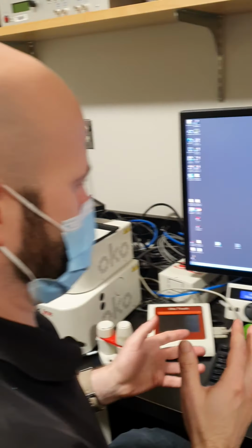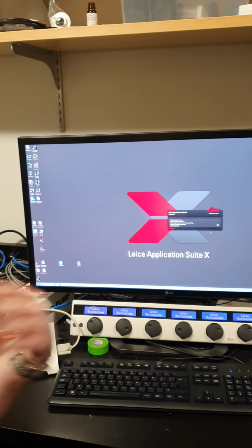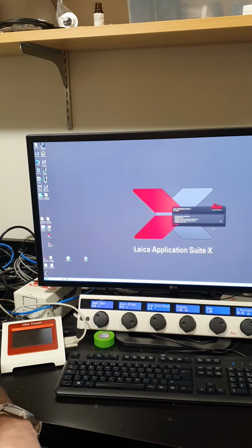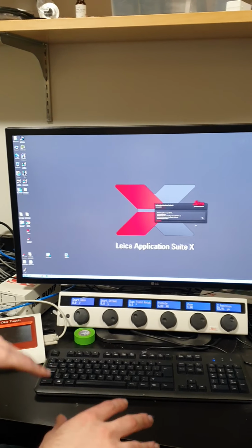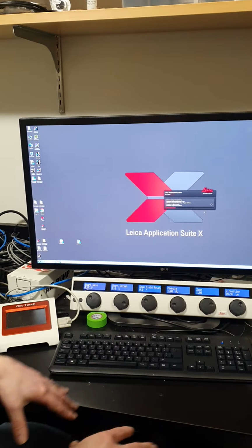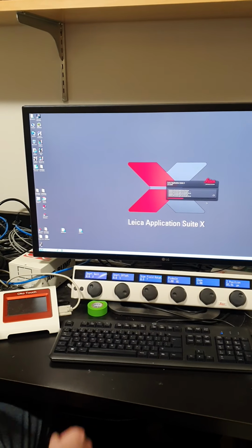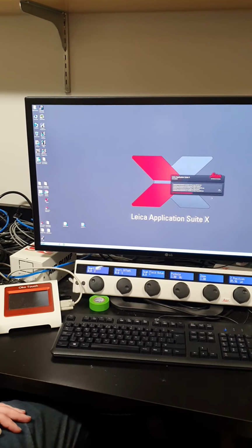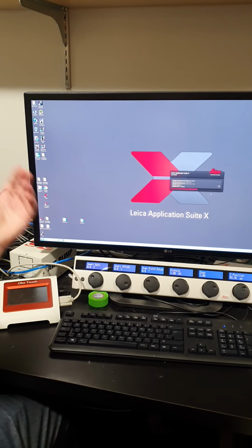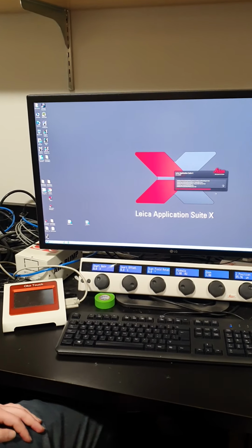And that's a choice you have to make in the startup. If you had said no, then once we were in the software, we wouldn't be able to use those functions, and you can't initialize it in the software. You would have to completely shut it down and restart it. So I recommend just going with yes. Because as you can see, that only took a few seconds, whereas the whole startup takes a couple minutes.